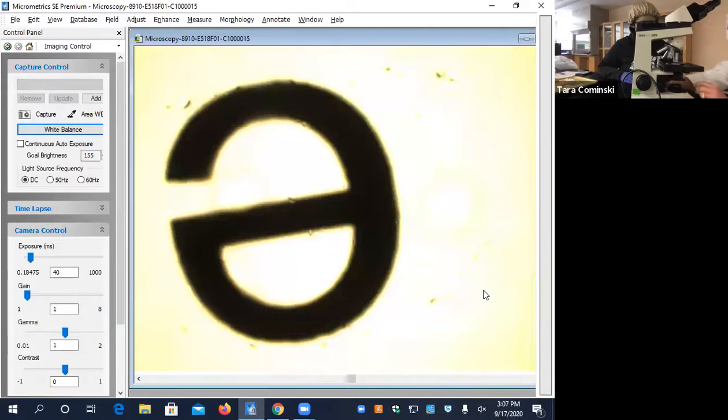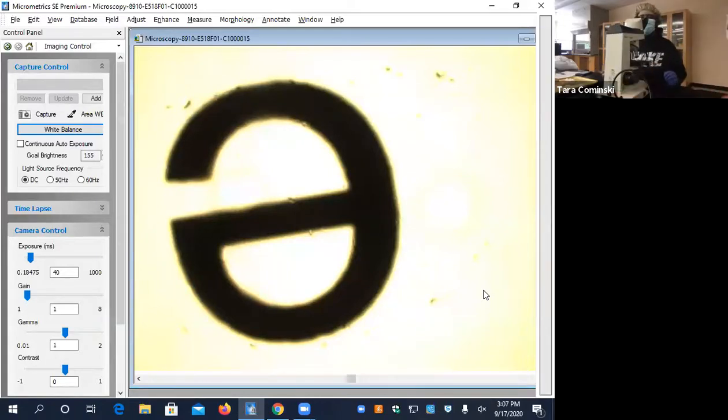Oh, here. Yes, this is closed. That's what it was, right here. Now look, I'll show you. So it was there. So that was closed, right? So then the light coming through was just this tiny little pinhole, and that's why you couldn't focus. Okay, there you go. I should have checked that. I don't know why that got changed. Did you get it? No.